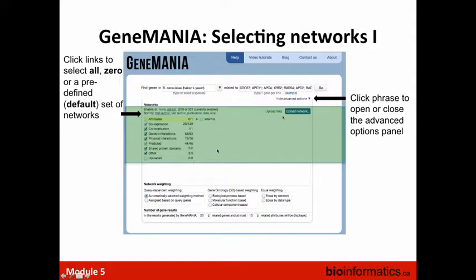I showed you opening the advanced options panel to select networks. If you don't select a network it gets assigned zero weight. Once you select the network, GeneMANIA assigns a weight either based on your gene list or based on some other measure of the relevance of that data source.